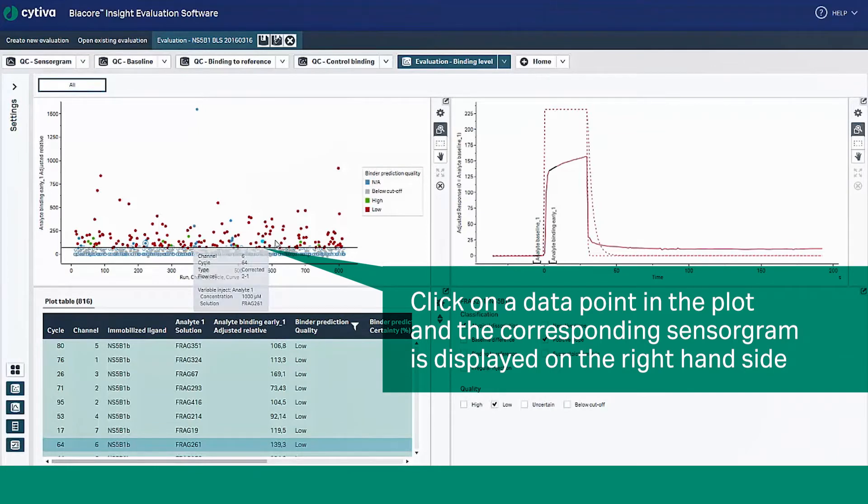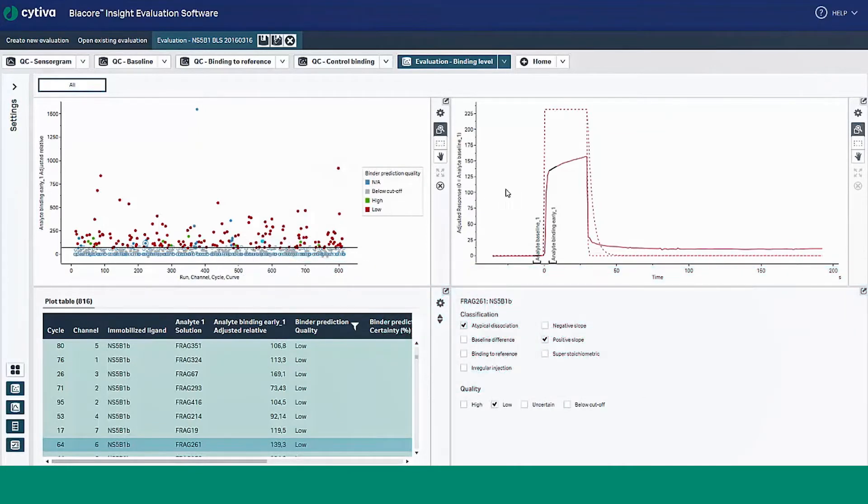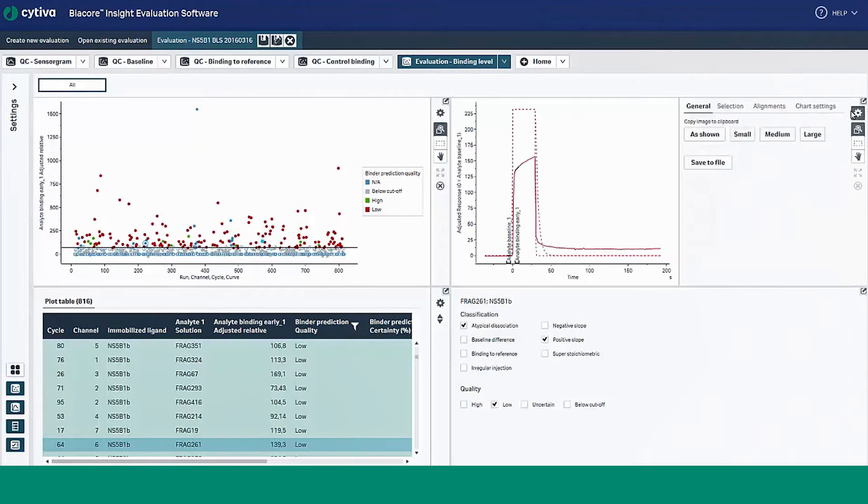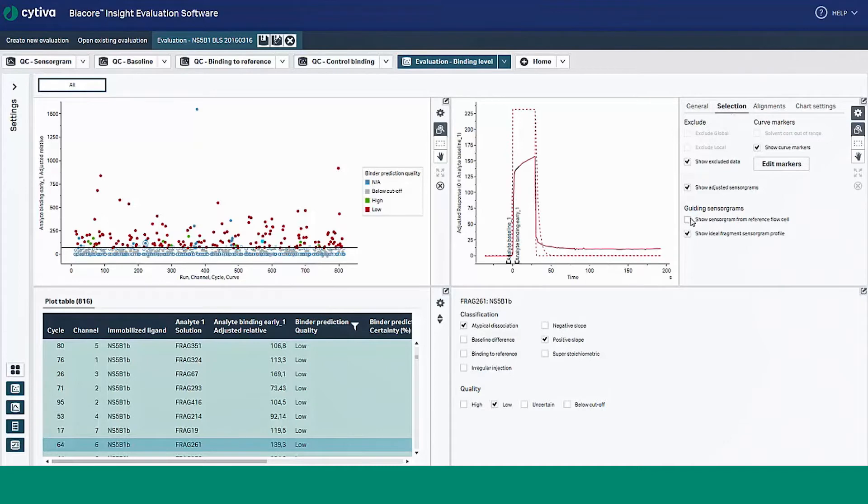You may notice some extra dash sensorgrams here. That's because we've included additional visualization tools to help enhance your understanding of the data. This is especially helpful for new users and provides extra information on ideal fragment sensorgram profiles and sensorgrams from the reference flow cell.